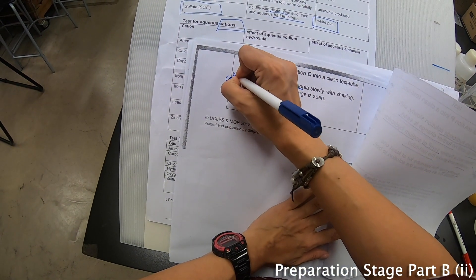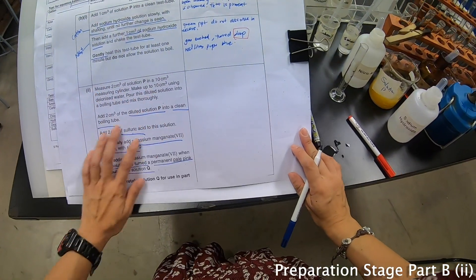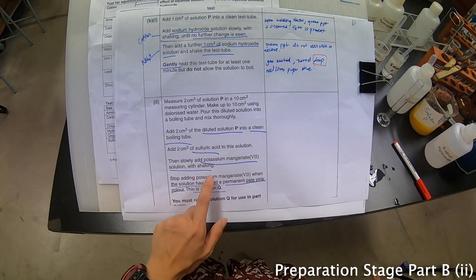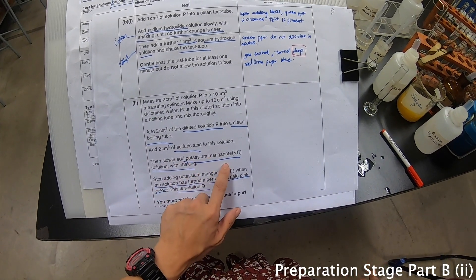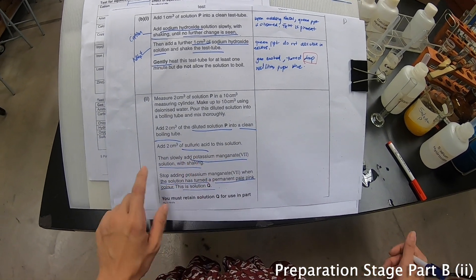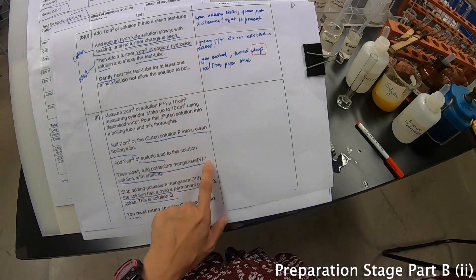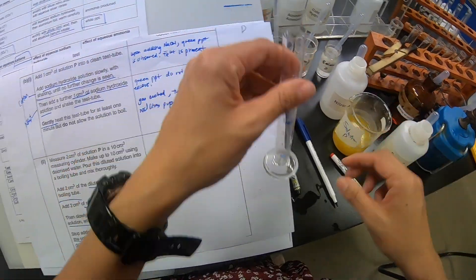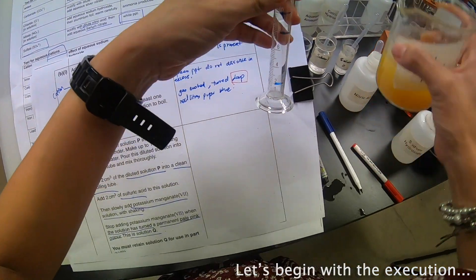I'm going to write a small note here. Some of you will be wondering: Ms Selena, what exactly are they testing? Well, they are actually acidifying the potassium manganate. Potassium manganate is an oxidizing agent. We already know this is Fe²⁺, so most likely they are changing it to Fe³⁺. Whether it is or not, we don't know — we have to do the experiment and see.